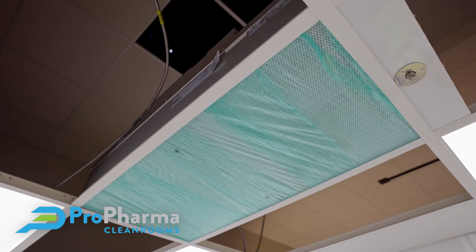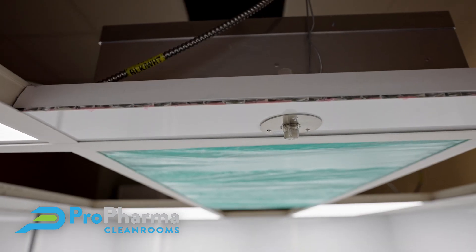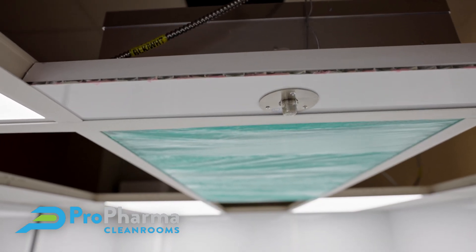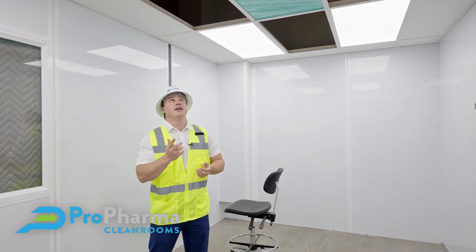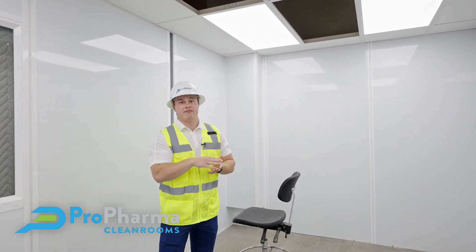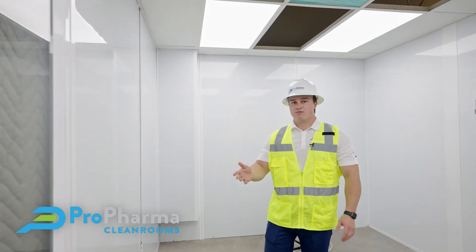This is a MAC-10 HEPA filter. If you take a look right here, this is called a challenge port. The purpose of this challenge port is so the certifier can hook up an aerosol test to it and actually test that HEPA filter — checking for any leaks — without having to cut the ceiling tile out and go above ceiling, which would cause the room to become uncertified or contaminated.